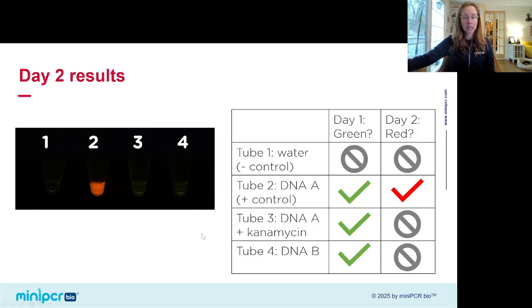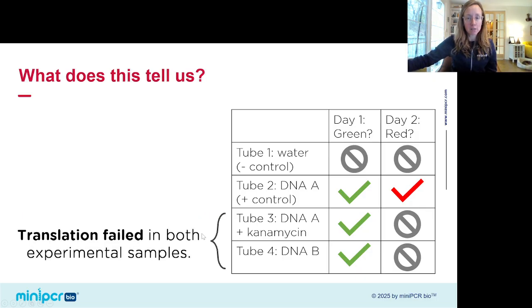So what does that mean again? Well, that means translation failed in tubes 3 and 4. We had successful transcription on day 1, but then on day 2, no translation. So let's talk more about what might be happening in each of those tubes.